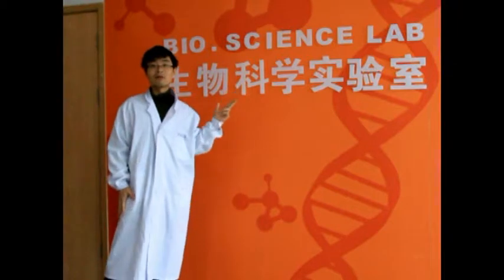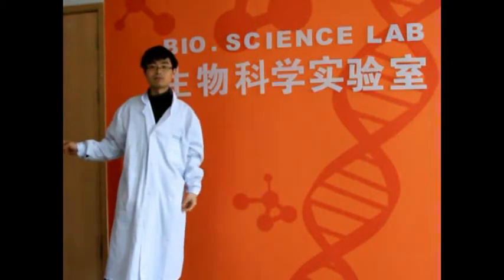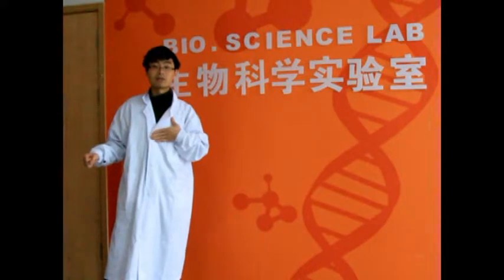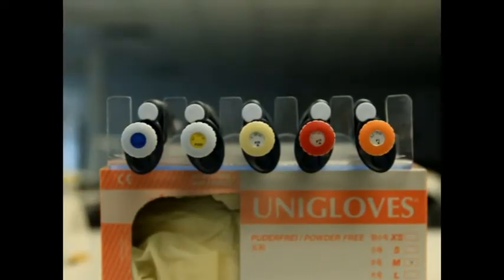Do you want to know how students do experiments in this lab? Okay, come in with me and I will show how they do their experiments. Come on. This video will introduce you to a specific pipette, pipetteman.